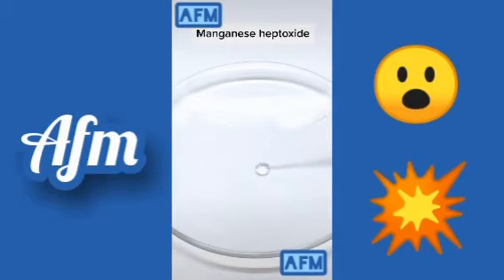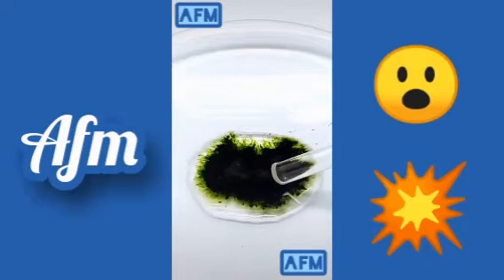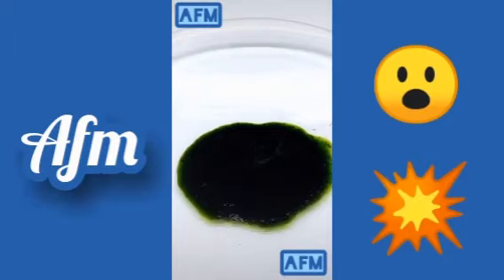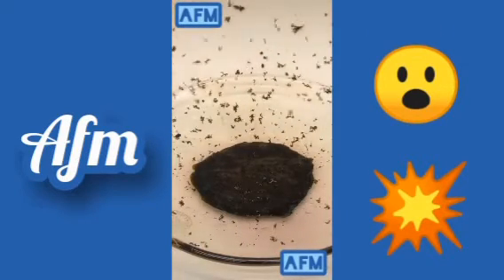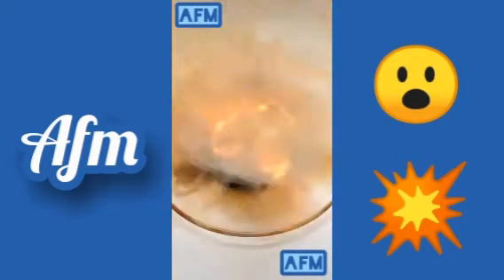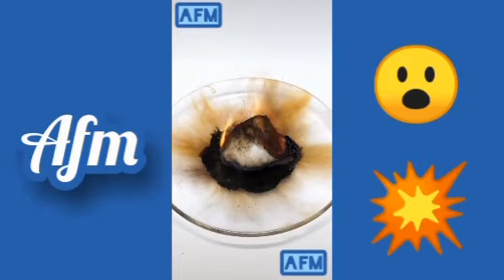So today, I've decided to make a really unstable chemical called manganese heptoxide. To do this, I just need to start with some sulfuric acid and then sprinkle on something called potassium permanganate. It makes this angry green liquid that can spontaneously decompose just by touching it. It also reacts with almost anything organic, and this is what it does to a cotton ball. It's even more violent with liquids, and this is what it does with ethanol and acetone.